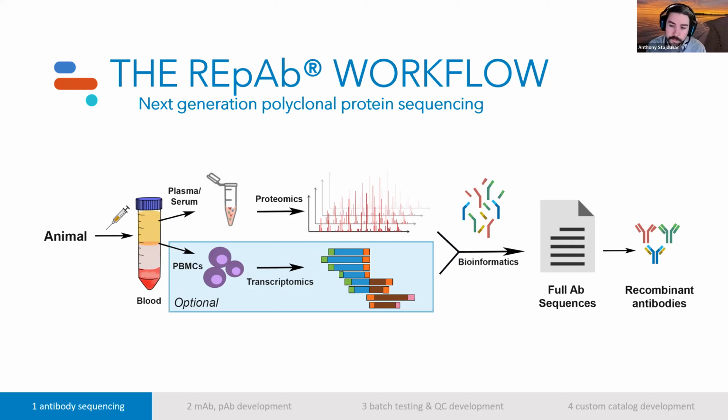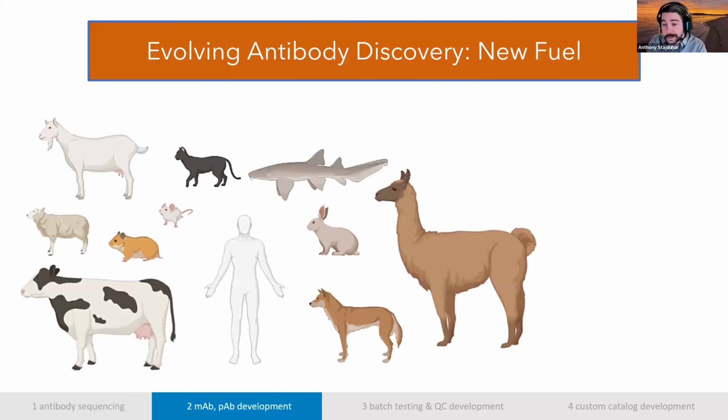We've definitely been able to work with a lot of projects and do truly de novo antibody sequencing directly from the serum of the immunized animal, or perhaps an older bleed that's been around for a while. One of the only other key conditions is that the serum come from a single donor, one animal. It can be taken from multiple time points, but truly just one animal. So one rabbit, one goat, one alpaca, what have you.